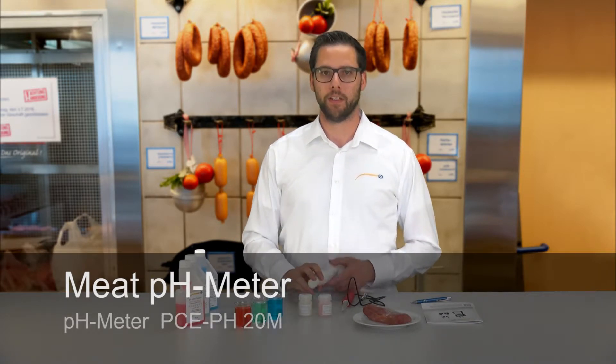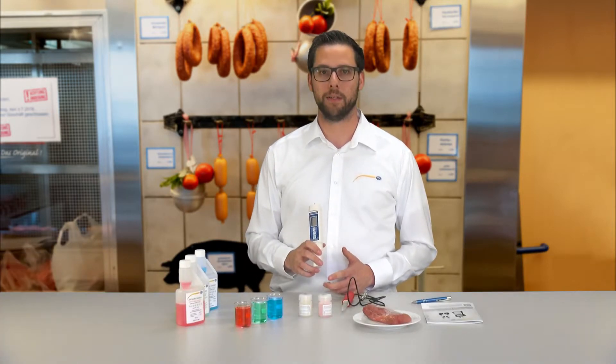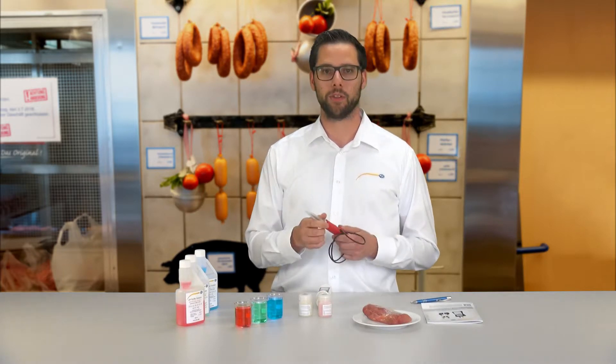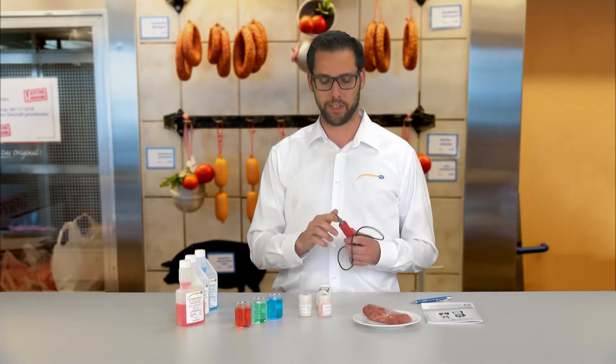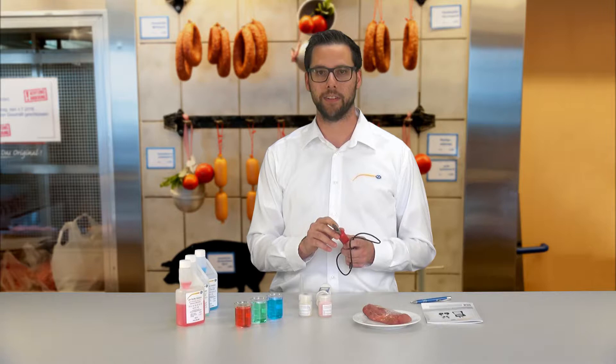The PCE PH20M is delivered with this basic unit and a special electrode for foods. This electrode is characterized through the stainless steel blade where the electrode sits in, which makes it possible to insert into solids without damaging the glass.